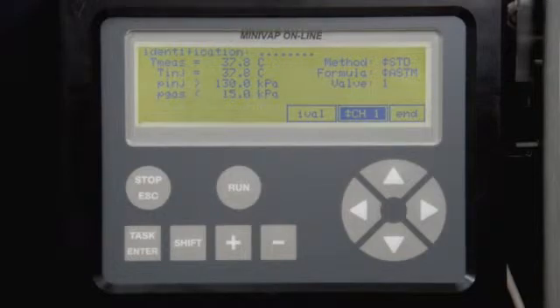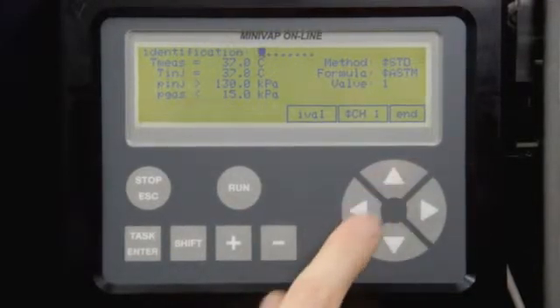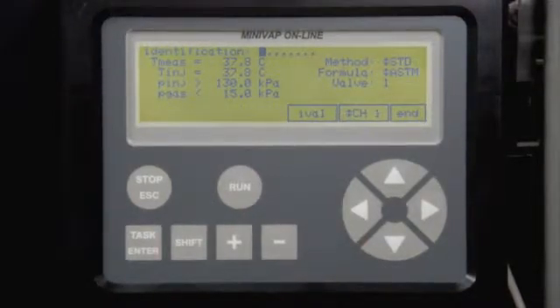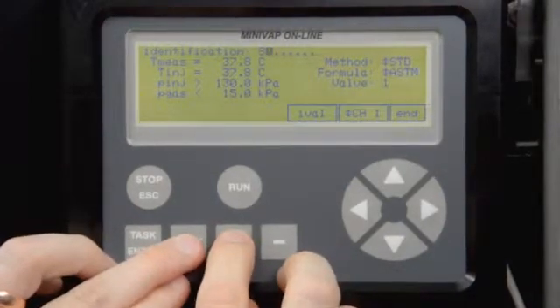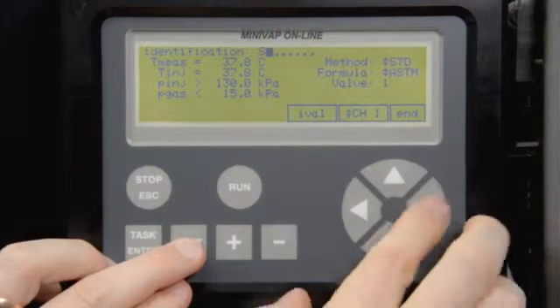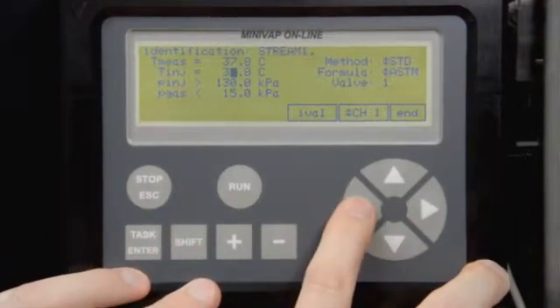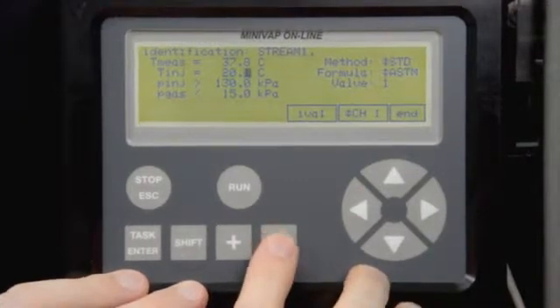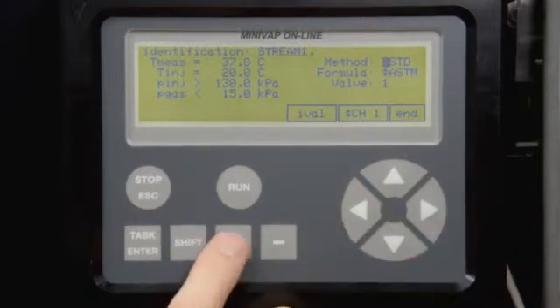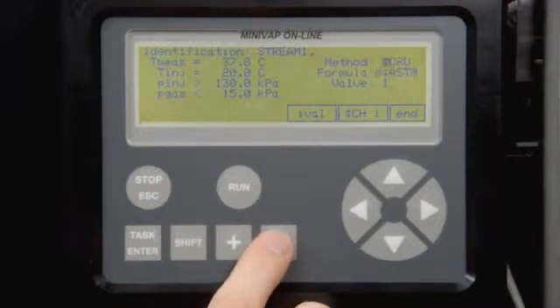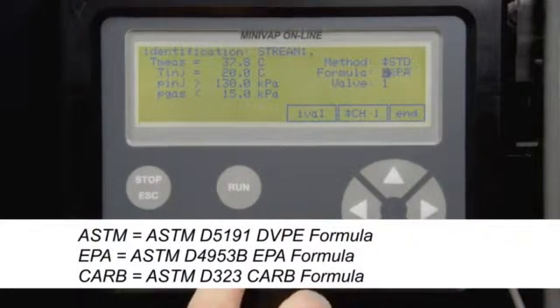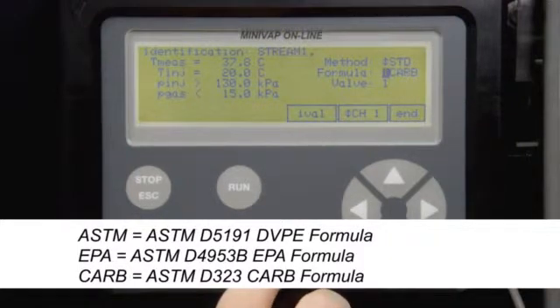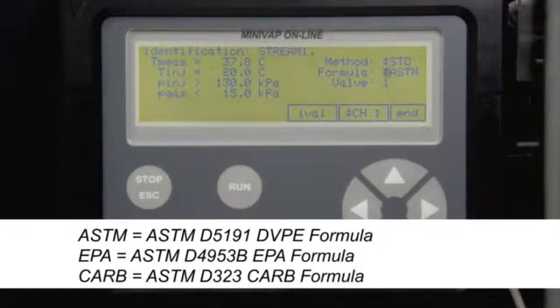Place the cursor to Channel 1 and select a measuring channel. Enter the channel identification. Use the plus-minus keys to scroll through the characters, or use Shift and plus-minus keys for fast scrolling. Select measuring and injection temperature, the minimum injection pressure, and the maximum gas correction. Select a method for gasoline, crude oil, or LPG. Then choose the standard and apply the correct formula. For standard gasoline measurements, ASTM is the approved DVPE formula for D5191 measurements. EPA is the EPA-approved correlation to ASTM D4953B.